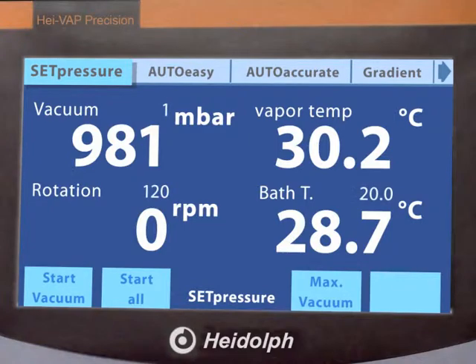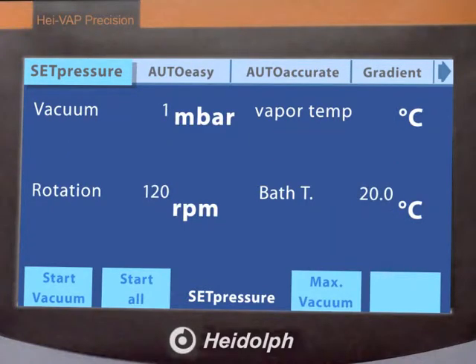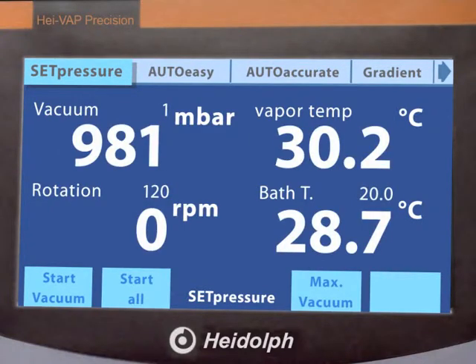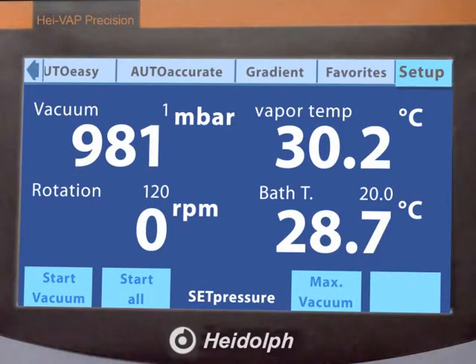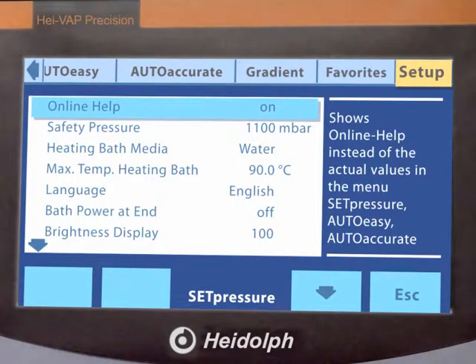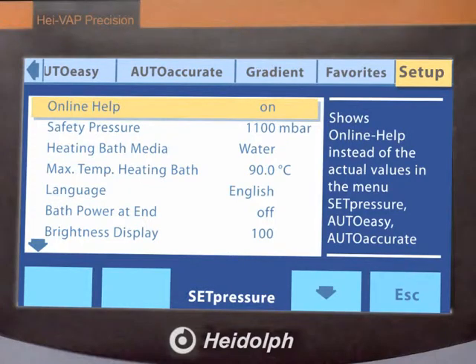All actual and set parameters are displayed at the same time. The setup menu allows for changing several parameters through a pull-down menu. Make your life easier by utilising the integrated software support, which leads you through the capabilities of this evaporator.